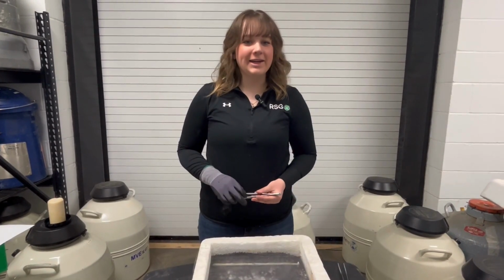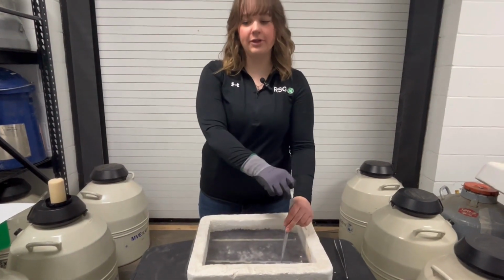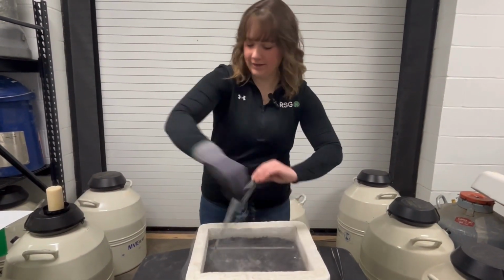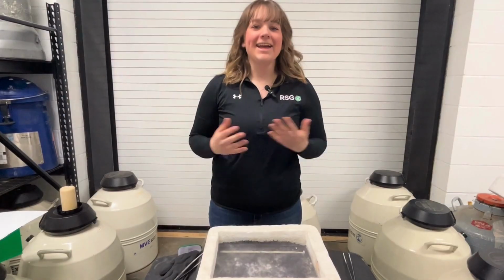Now that your order is split, you're ready to hand it off to your client. So you're going to use your forceps to pick up the cane that's under the liquid nitrogen, grab only the tab, and transfer it back into your receiving tank. Noting that, again, the air time was less than 3 seconds for that semen. And that's all there is to it.